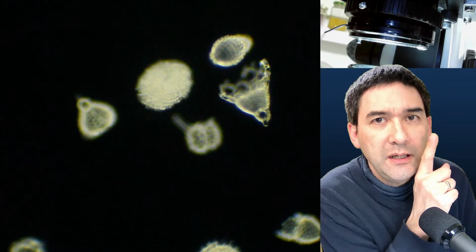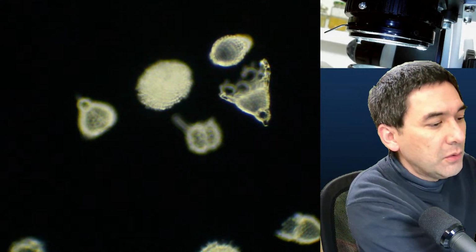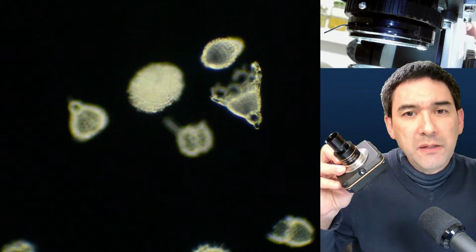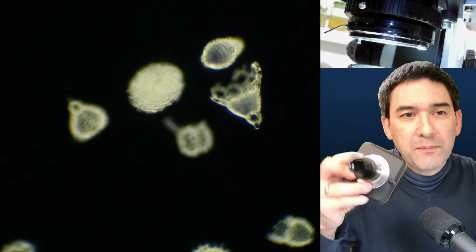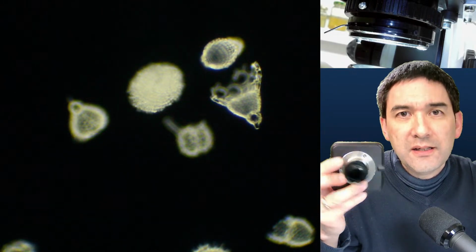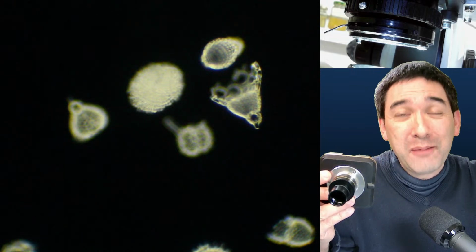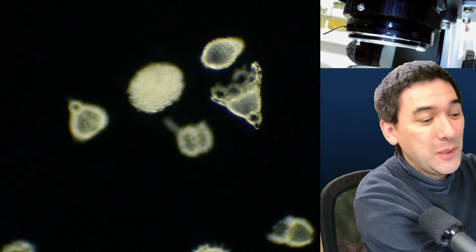I also wanted to tell you another little technical detail. Currently, I've got a DSLR camera connected. You might already know that I also have those USB microscope cameras, but there is a reason why I'm not using this. One of the reasons is that it's not quite as light sensitive as my DSLR. And the second thing is that there is no easy way to adjust the exposure time. I have to go into the software and adjust it, and this takes quite a bit of time.